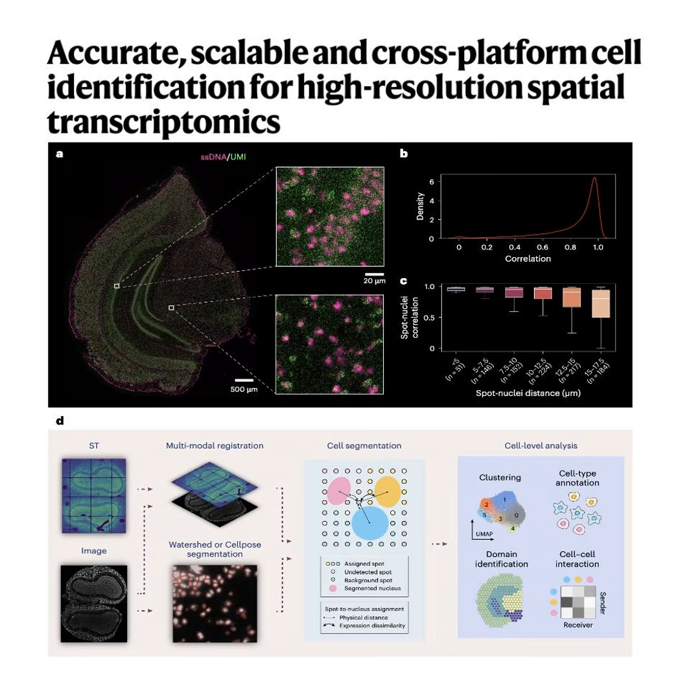Yes, definitely. So the first camp relies on imaging-based ST. We're talking about platforms like MERFISH, STARmap, seqFISH plus, or 10x Xenium. These use pre-designed fluorescent probes that bind to specific RNA sequences directly in the tissue. Then a highly advanced microscope physically images the glowing dots. So you get incredible single-molecule resolution. You do. The downside is that you are usually limited to a targeted panel of genes, maybe a few hundred or 1,000, and the physical area you can scan is relatively small. Right. So what's the second camp?